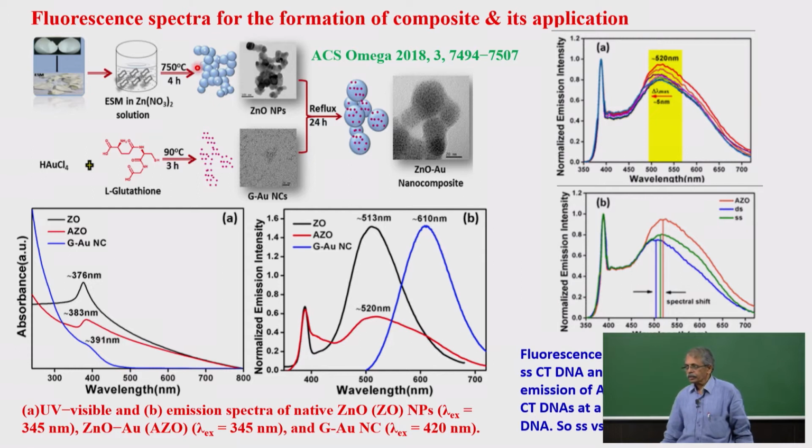So this particular thing, zinc oxide nanoparticle, how do we know? By looking at the TEM spectra. Right now you don't need to worry about that part, though I have shown it here.